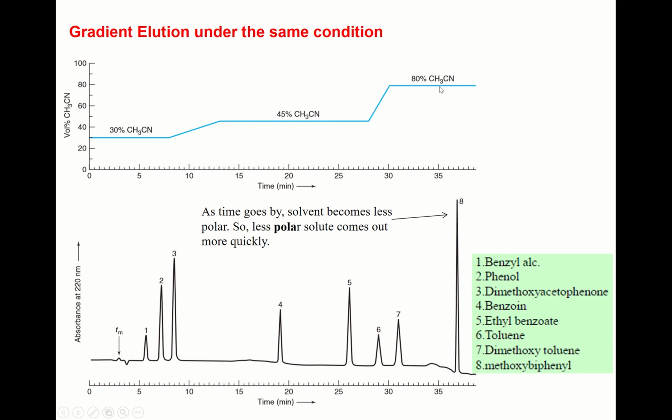So the idea here is that you increase the acetonitrile portion relative to aqueous, which means that acetonitrile is less polar than water.